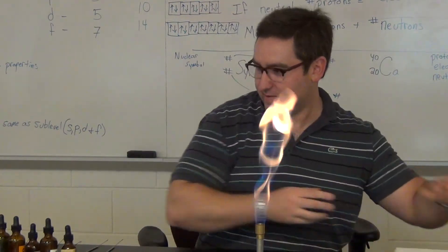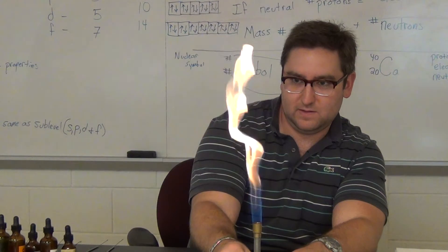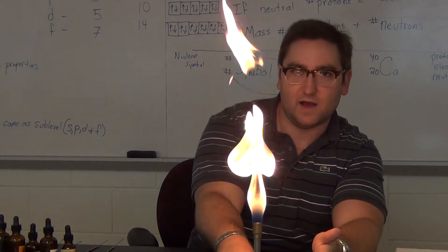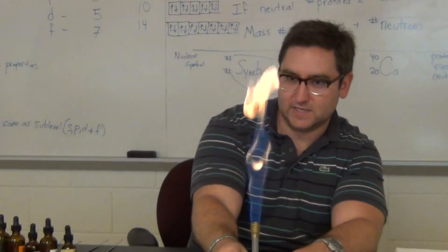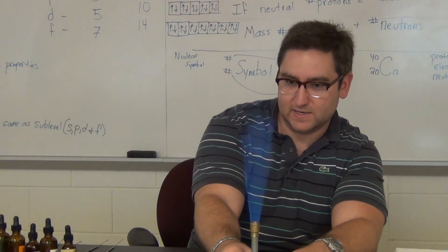Here's our Bunsen burner flame. If we take away the oxygen, it's yellow. If we add in oxygen, it's going to make the flame hotter and give it that blue color.